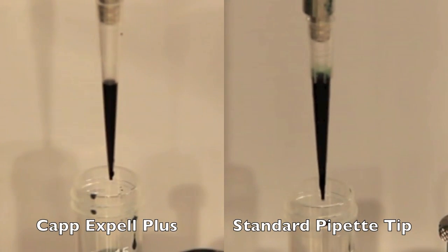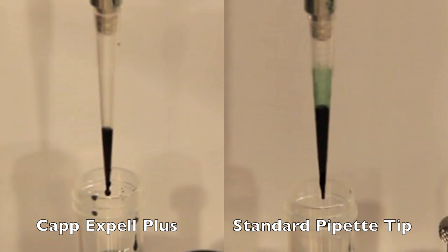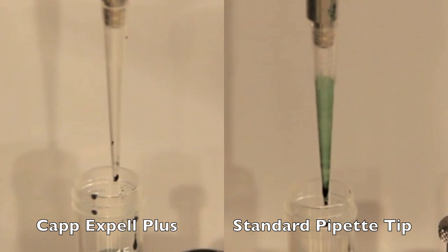Now we'll be looking at the two pipette tips side by side. As you can plainly see, the EXPEL PLUS retains much less of the sample than the standard pipette tip.